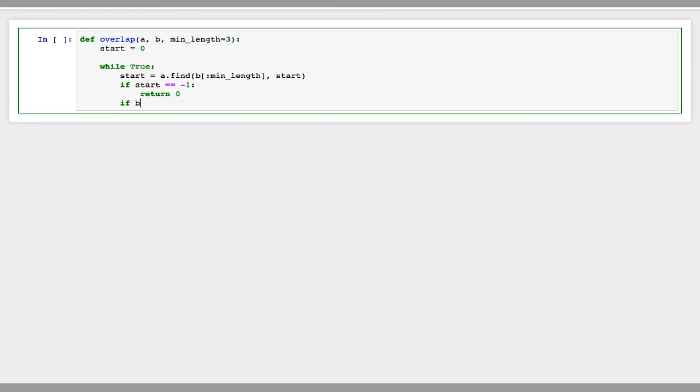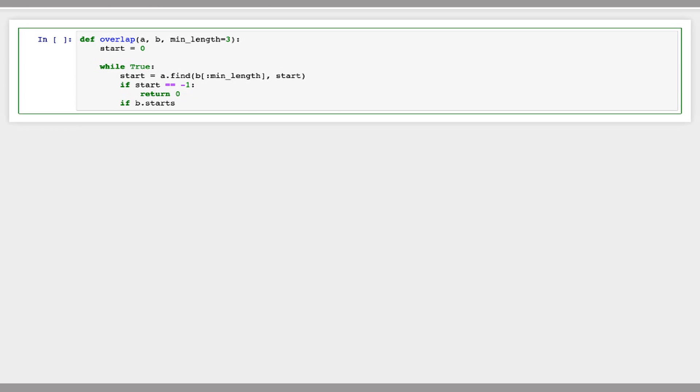So we'll say if b.startswith the suffix of a from start onward, this just verifies that the prefix of b is equal to the suffix of a starting at position start.